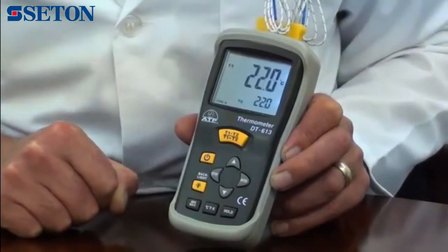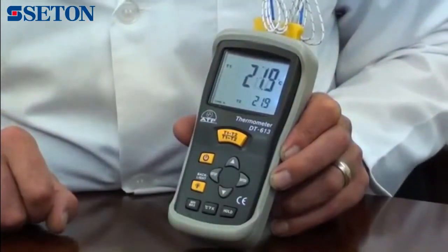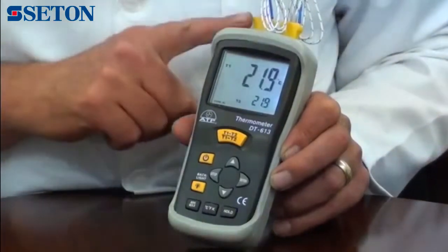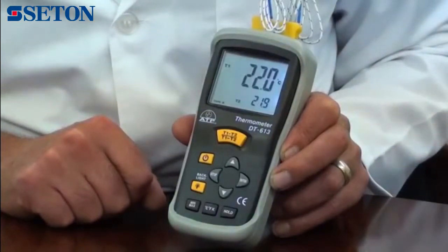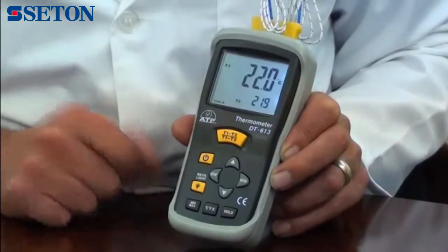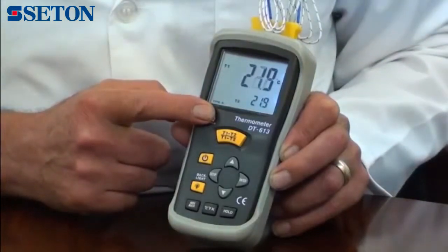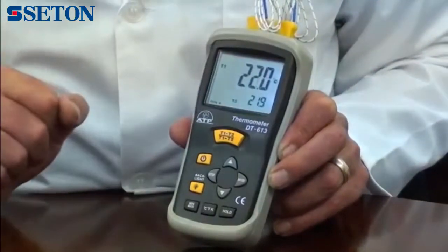The user can select readings to be displayed in degrees C, degrees F or Kelvin. Having two probe inputs, the thermometer can be used to measure two different temperature sources, with easy selection of individual measurements or differential. Differential displays the difference in temperature of probe 1 temperature minus probe 2 temperature.